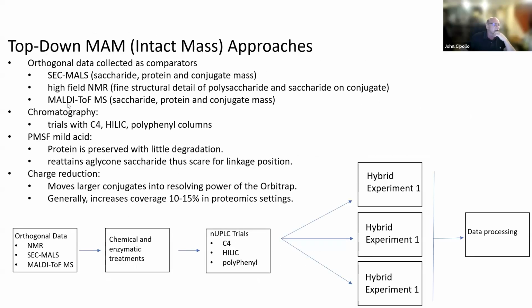Okay, so this is just kind of an outline of an approach. I won't get into this in too much detail, but we're taking an approach where we'll test a number of different orthogonal data to give us information in this process. The chromatography, we are in the process of trying different matrices to best suit the application.